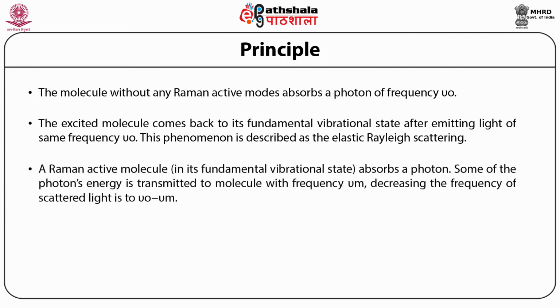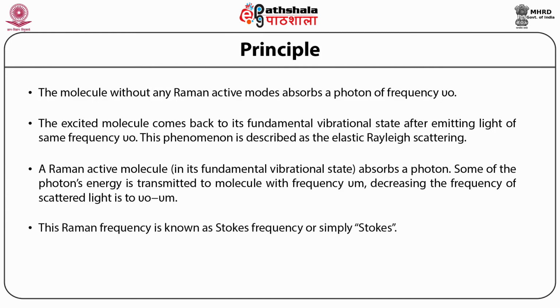A Raman active molecule in its fundamental vibrational state absorbs a photon. Some of the photon's energy is transmitted to the molecule with frequency nu-m, decreasing the frequency of scattered light to nu0 minus nu-m. This Raman frequency is known as Stokes frequency or simply Stokes.